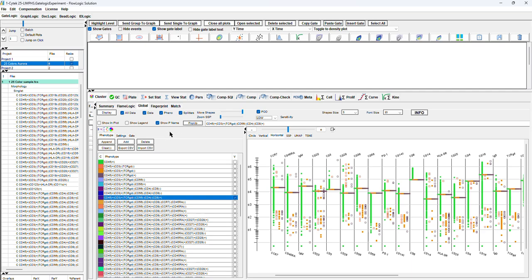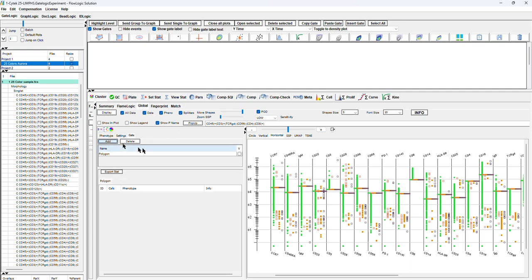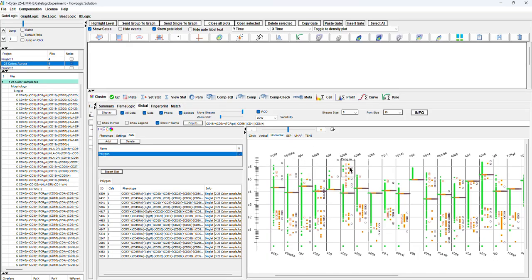So now we go and we extract using our gate, and you can see with the gate we are getting the data for this specific parameter. We are getting all the positive for this specific parameter, and when we are ready, here we have the list, which is very difficult to understand.